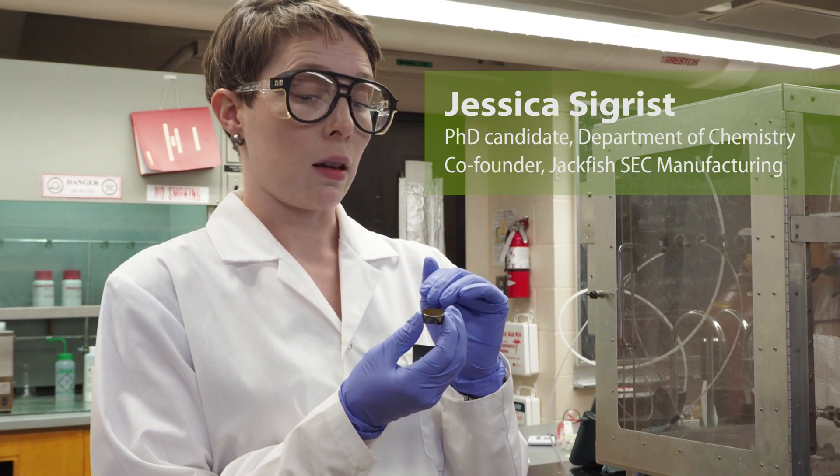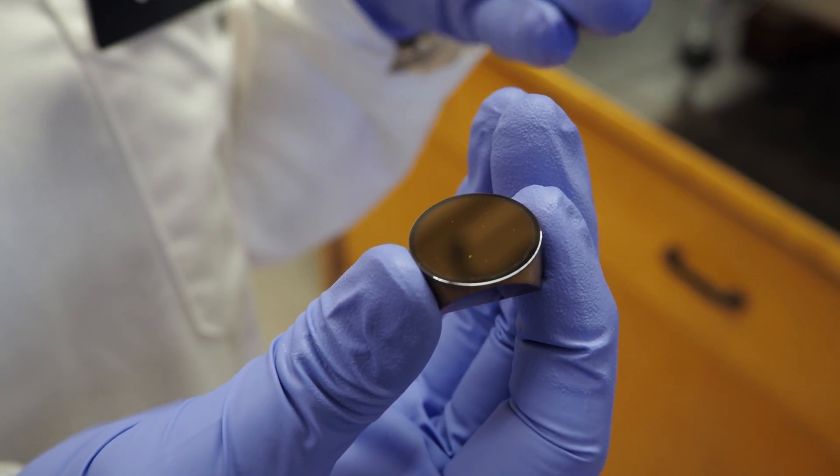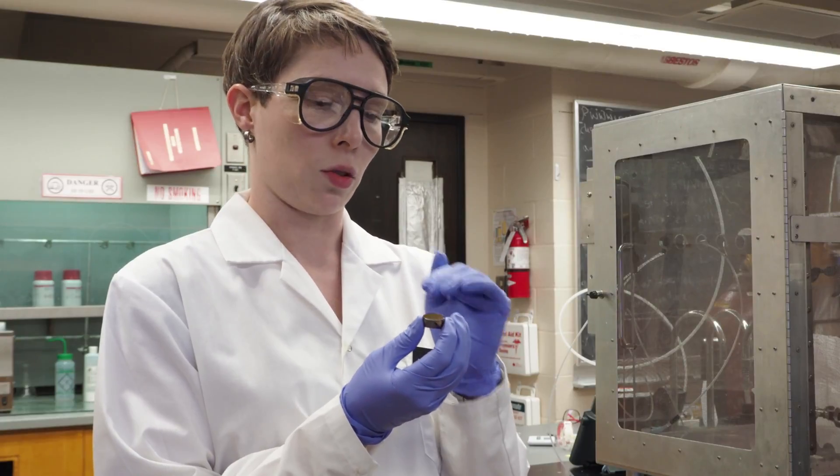What I have here is a silicon crystal which we've coated in a thin layer of gold. We are going to be able to study molecules that are right at the surface of the gold.